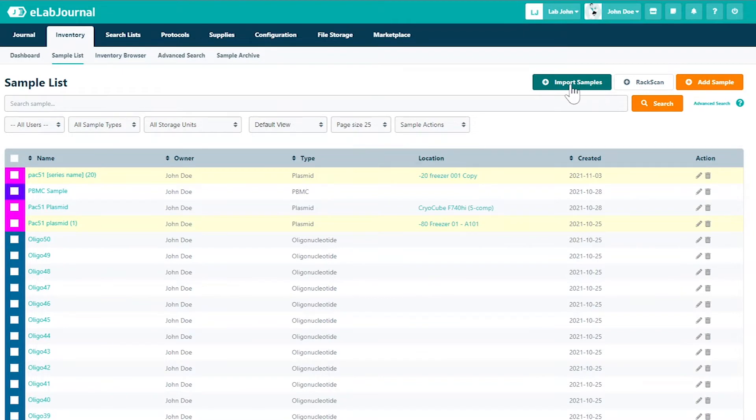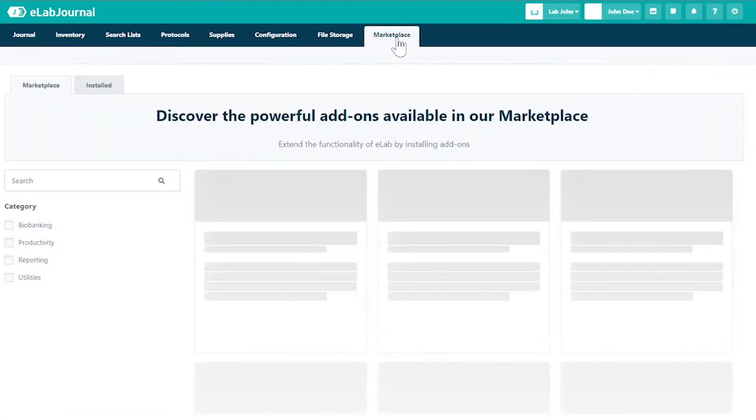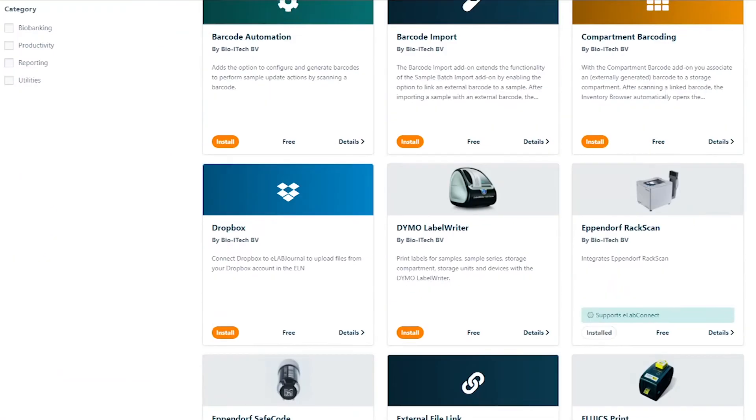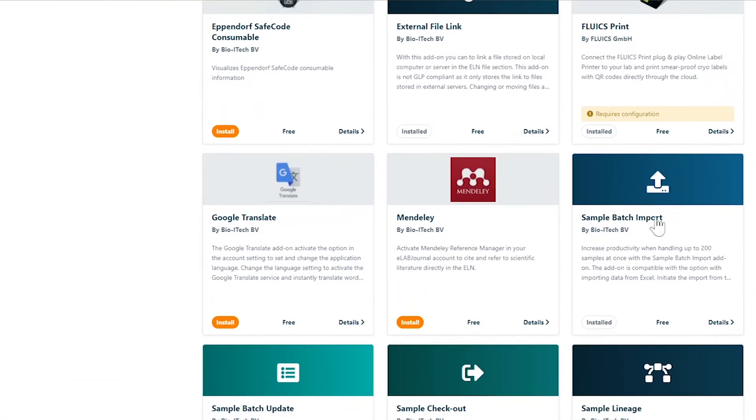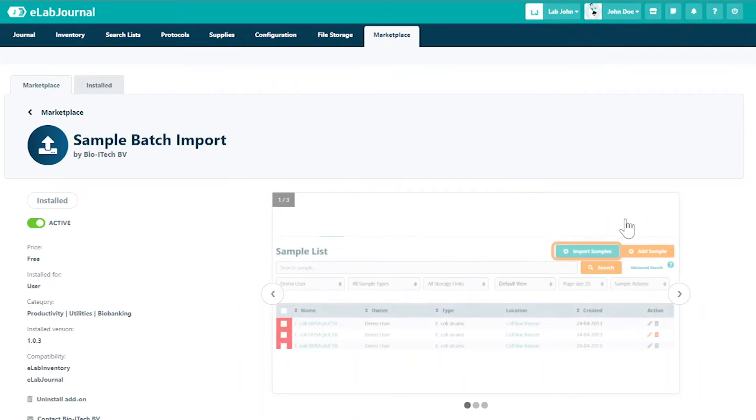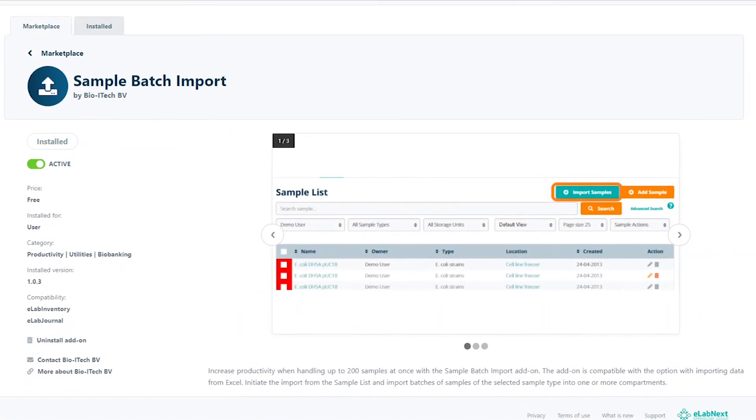To deactivate the add-on, return to the Marketplace. Select the add-on from the catalogue and deactivate it by flipping the switch.